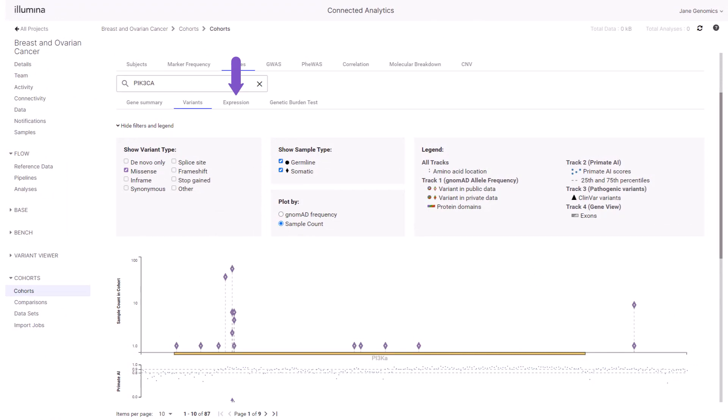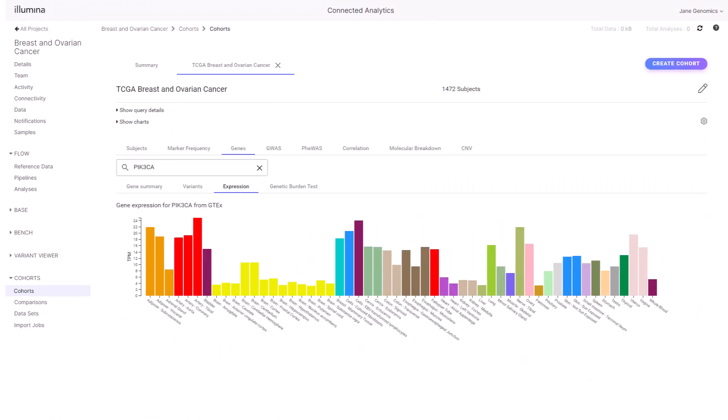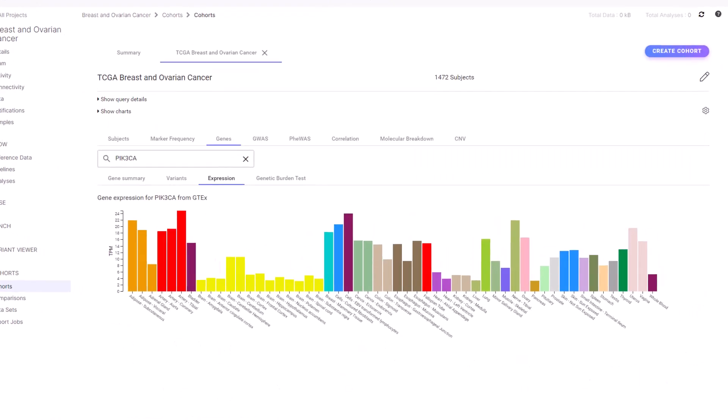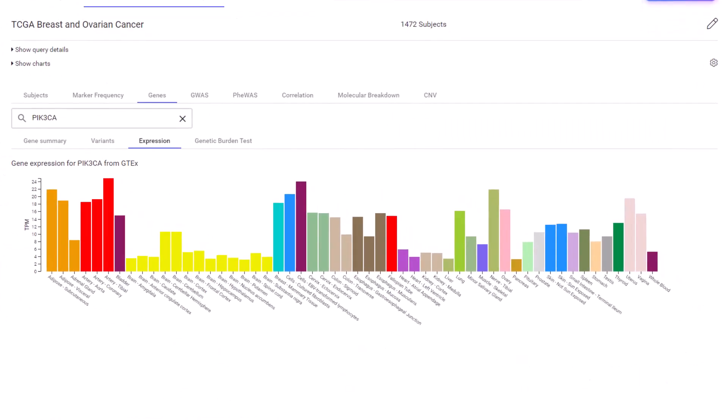Select the expression tab and notice that the normal breast and normal ovary tissues have a relatively high PIK3CA RNA expression in GTX RNA-seq normal tissue data but is ubiquitously expressed.